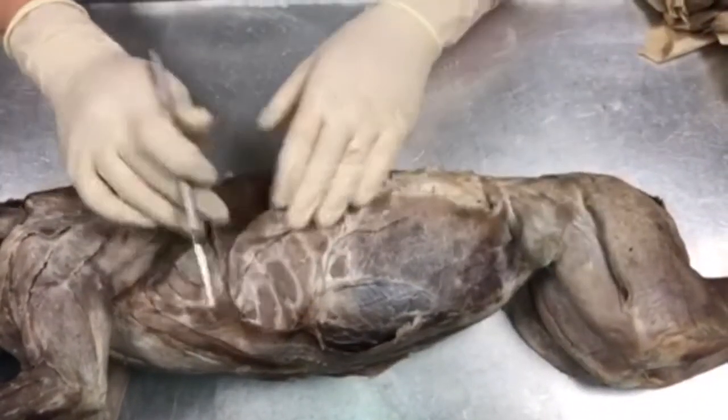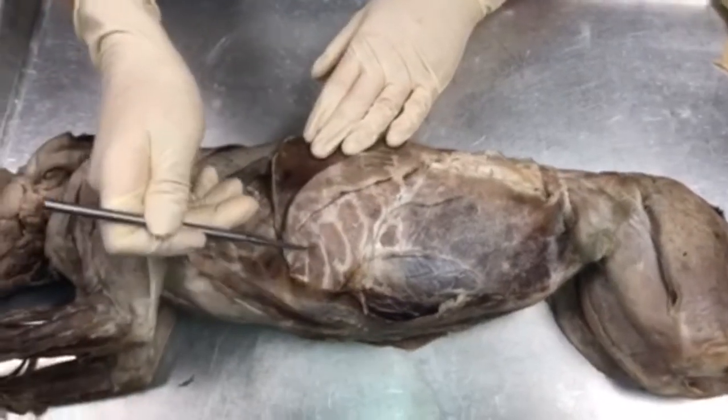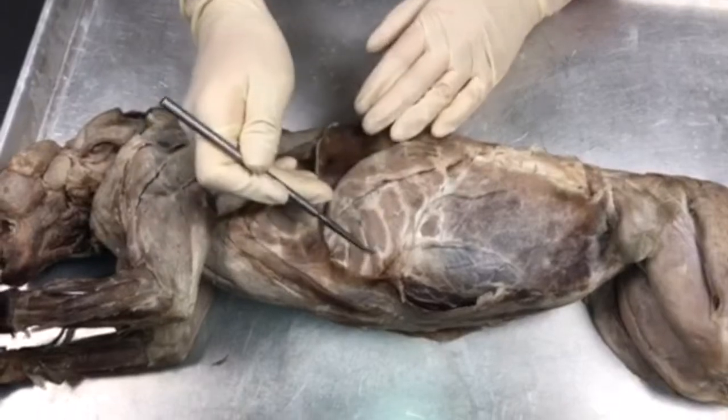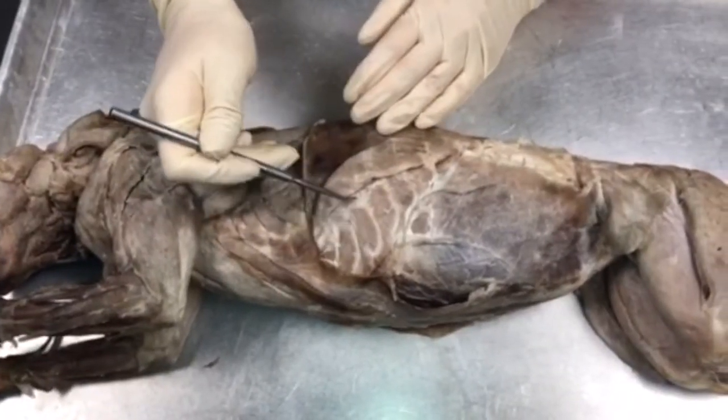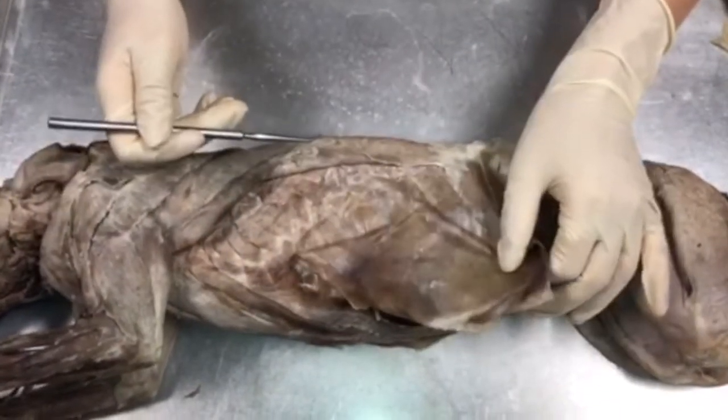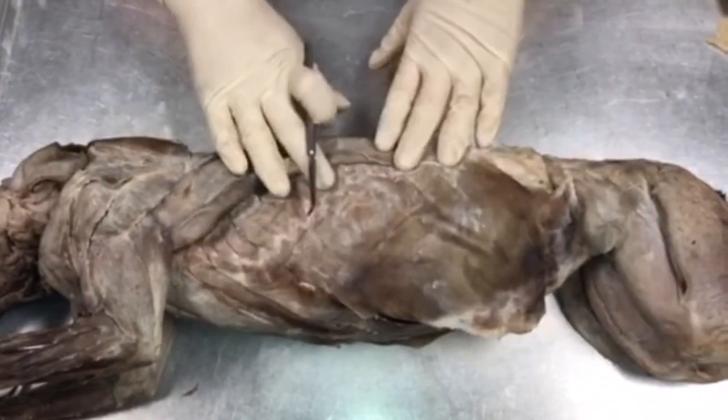Moving up towards the ribcage, these muscles going between each rib are going to be known as your internal intercostals. The external intercostals can be seen more towards the dorsal side of the cat — we're just unable to see them at this moment.